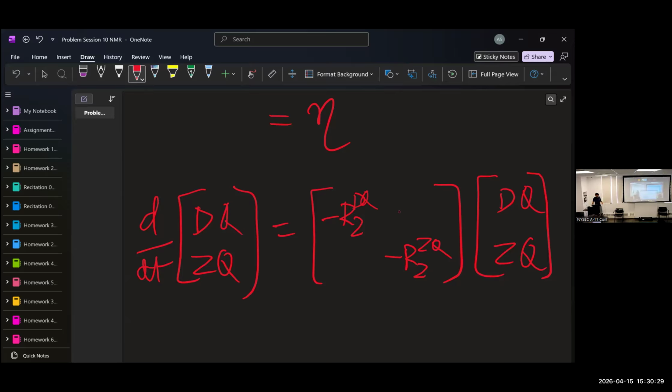And if you perform a simple linear transformation on this matrix to go from the double quantum and zero quantum basis to the XX and YY basis, you will get an off-diagonal cross relaxation term. That's one of the most common measurements in solution NMR for this CSA cross-correlated relaxation. That's how it's done for N15 proton. You create an N15 proton XX experiment and a YY experiment, and you measure how they cross relax.